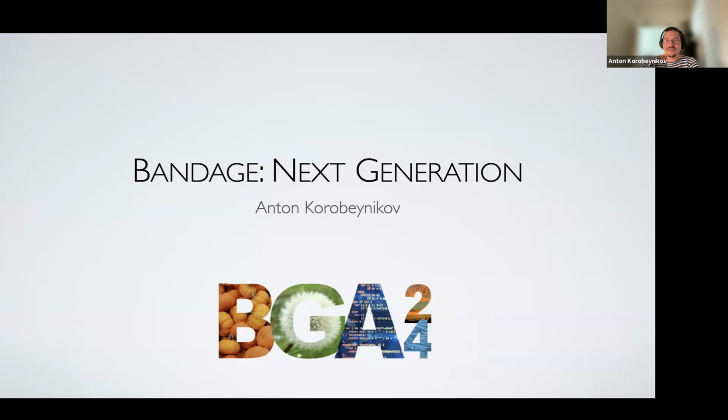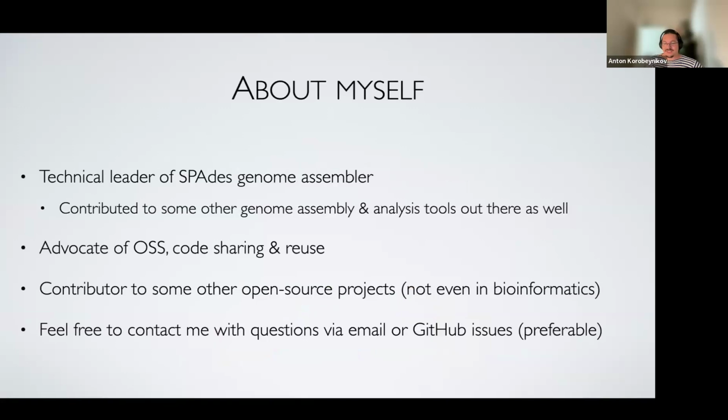So let's start. We're going to talk about Bandage. Actually not the original Bandage, but Bandage Next Generation. But before we start, let me just give a brief introduction.